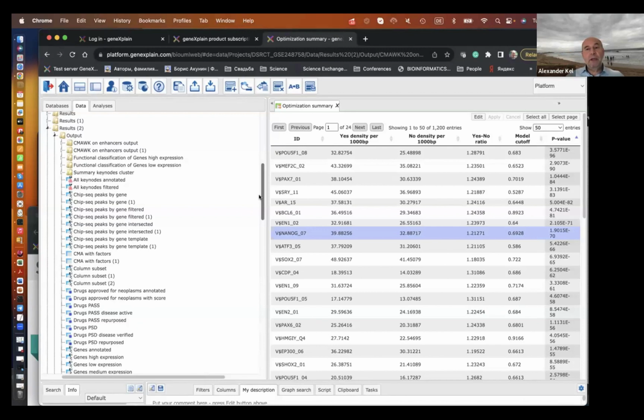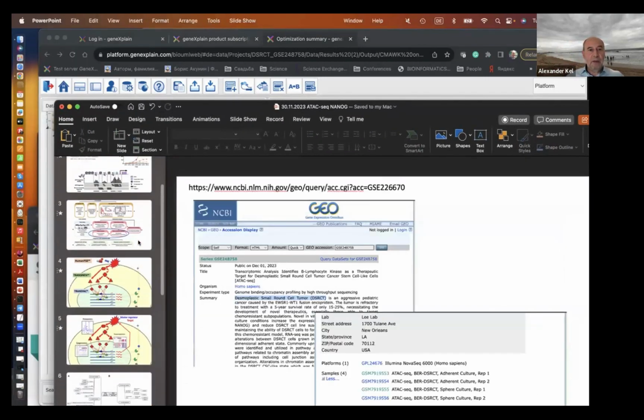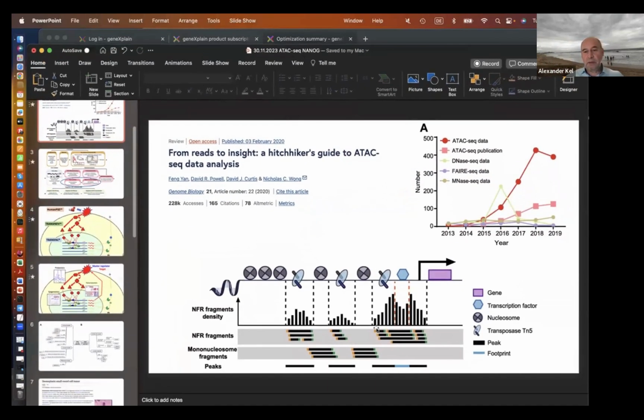But I would like to comment on one question we just received recently from one customer. They ask if for the ATAC-seq data, we also use the quantitative information. So the quantitative information means that in this ATAC-seq data, like I showed in the first slide, you not only have the regions by themselves, which we were just analyzing. So we took these peaks and we were analyzing the regions independently of the size of the peak. But obviously those peaks are of different size.